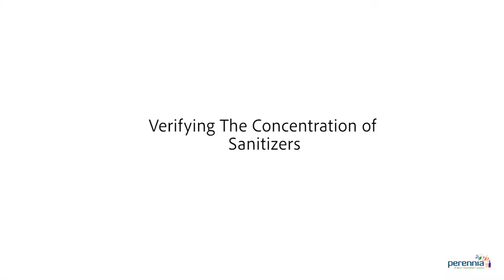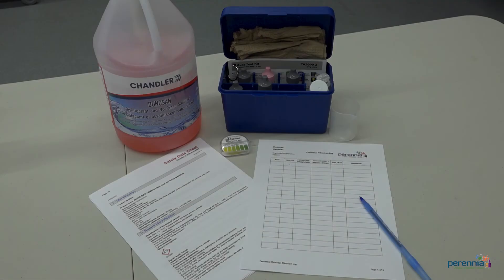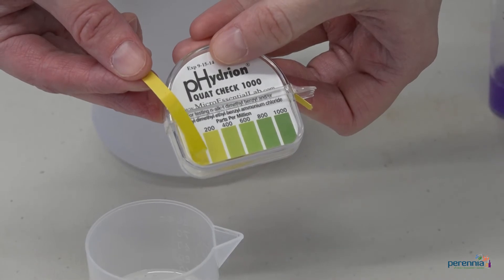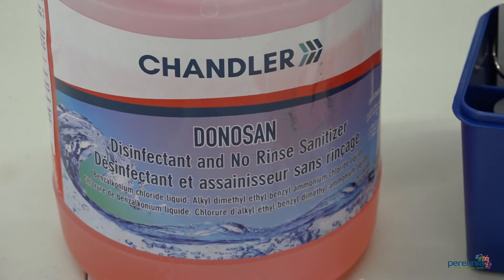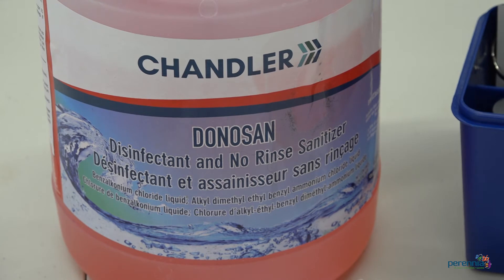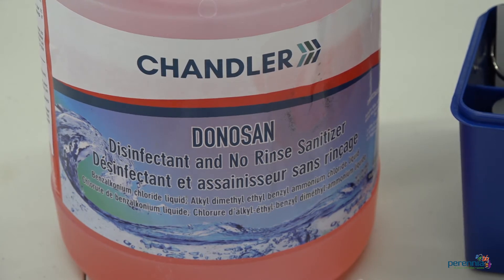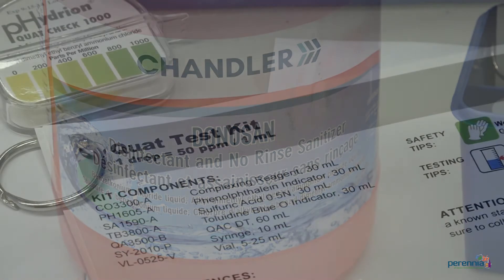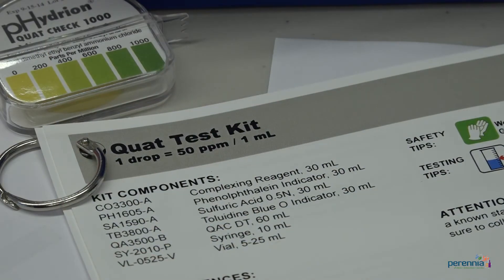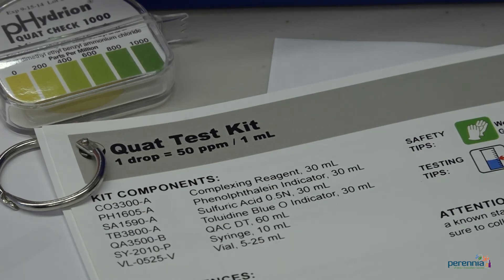To ensure you're using the correct concentration of sanitizer for your sanitation procedures, you can verify the concentration by performing a titration. Quat test strips may also be used in lieu of the titration method. For today's demonstration we will use Chandler's Donosan, a quaternary ammonium sanitizer used after cleaning for sanitizing processing equipment and other hard surfaces. To effectively sanitize equipment and surfaces without requiring a potable water rinse, this sanitizer is to be used at a concentration of 200 parts per million.